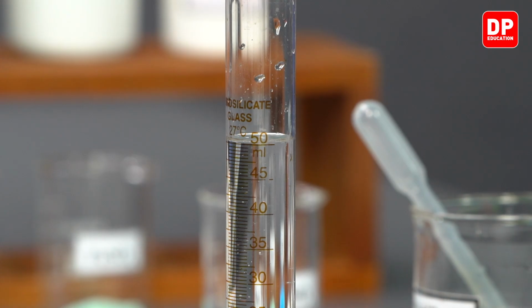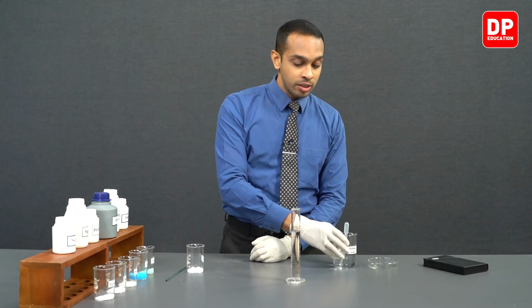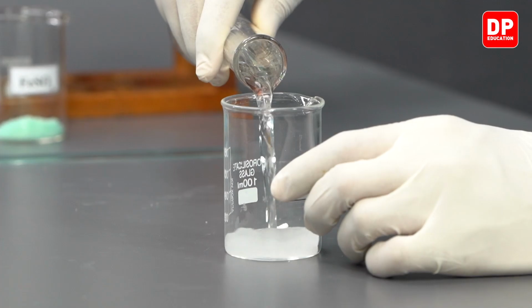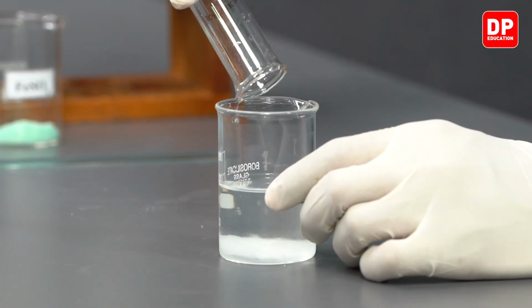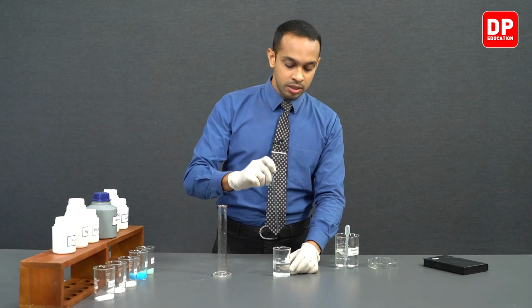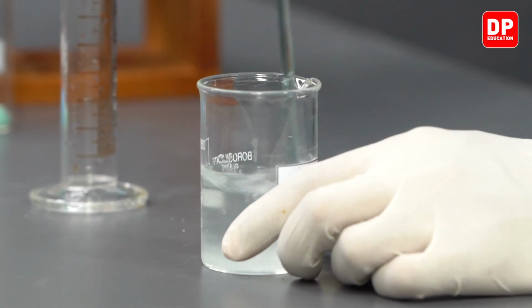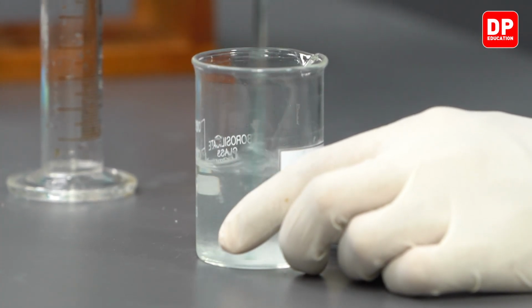Now after reading the volume correctly, you can then proceed to add this 50 milliliters of water into each of these beakers. And then you can take a clean stirrer and mix the contents in the beaker until all of the solid completely dissolves.